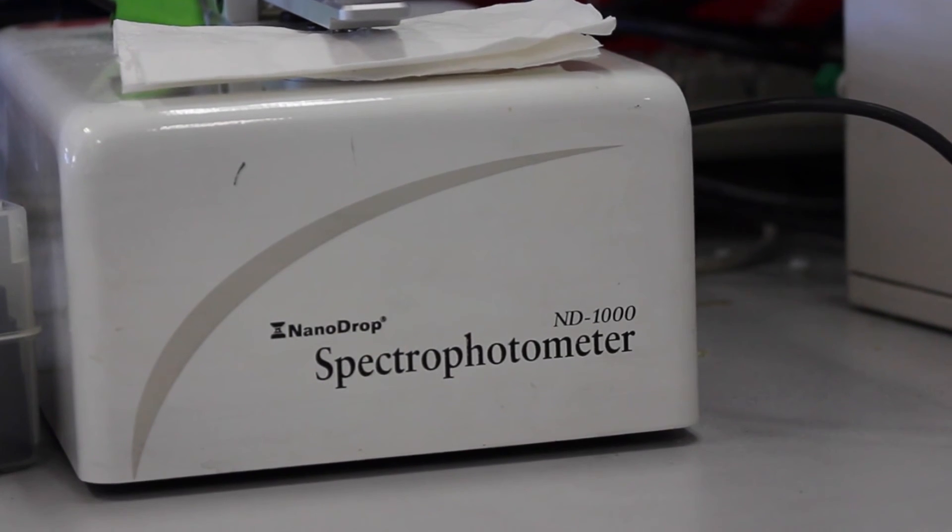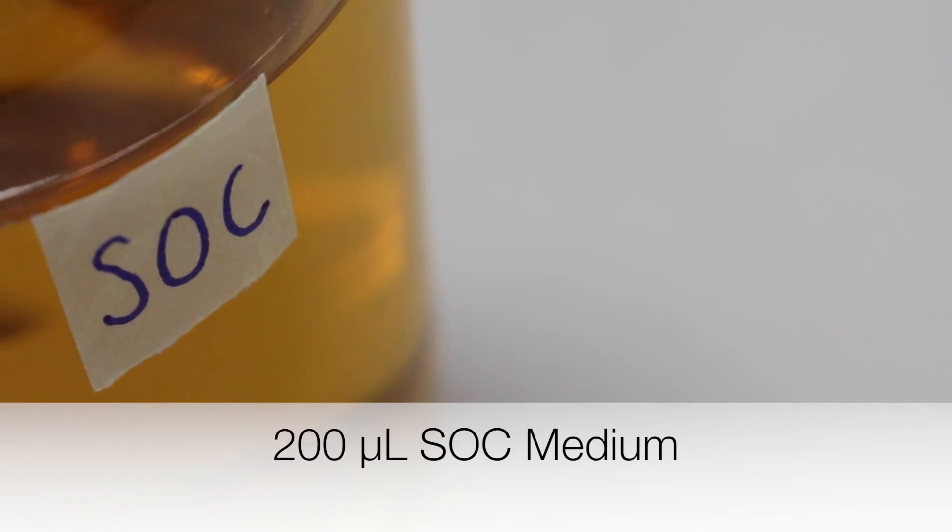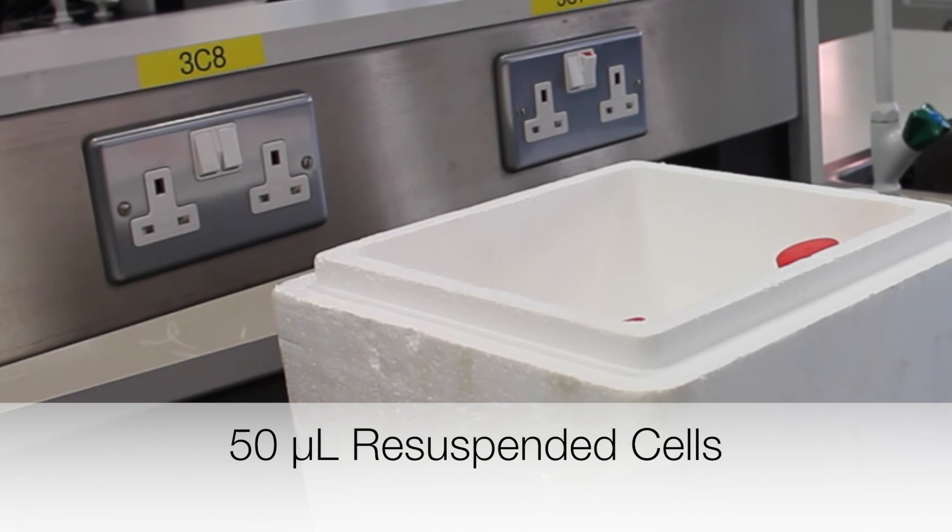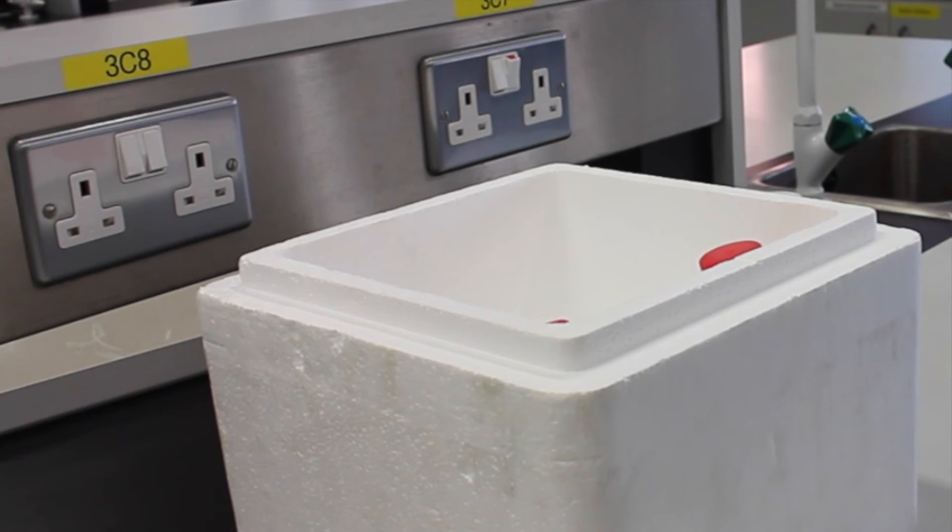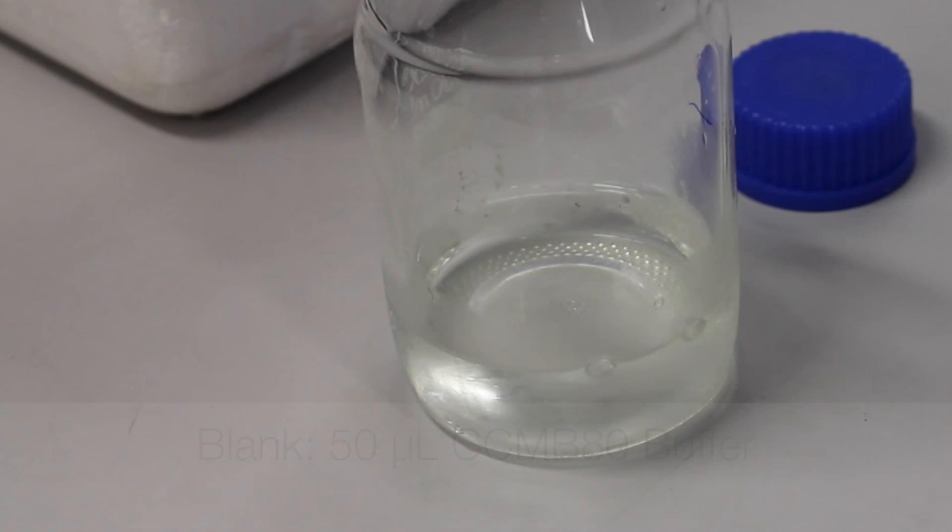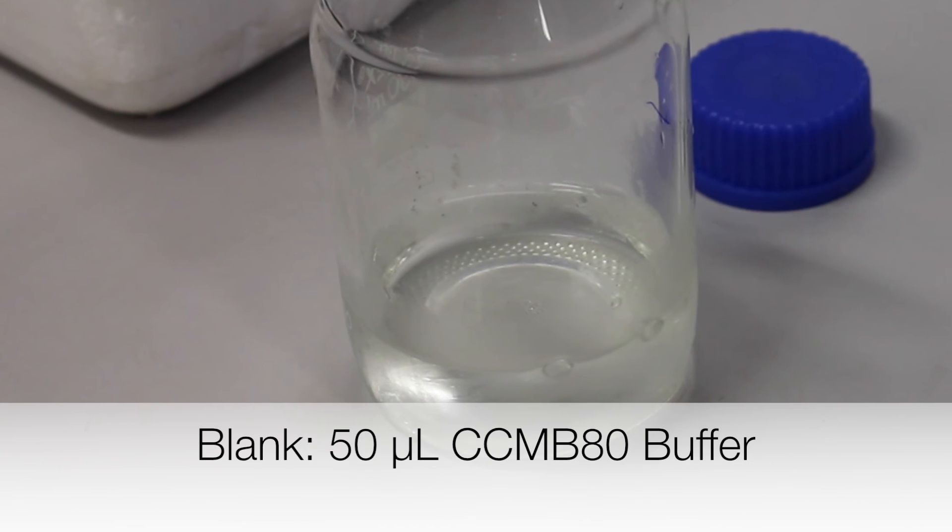Use the NanoDrop to measure the optical density of a mixture of 200 µL of SOC medium and 50 µL of the re-suspended cells. Use a mixture of 200 µL of SOC and 50 µL of CCMB-80 buffer as the blank.